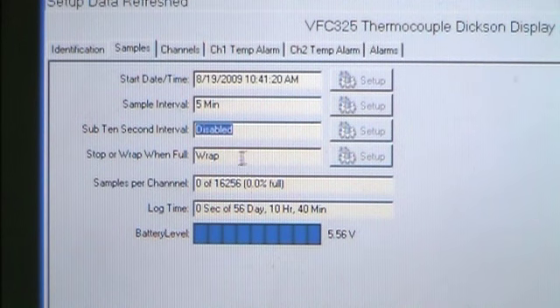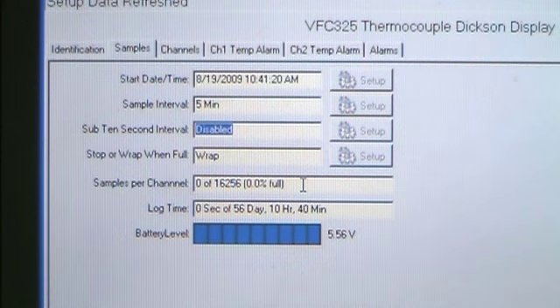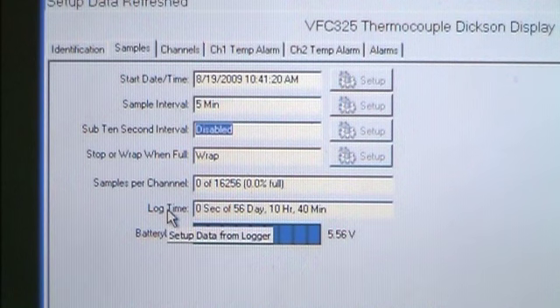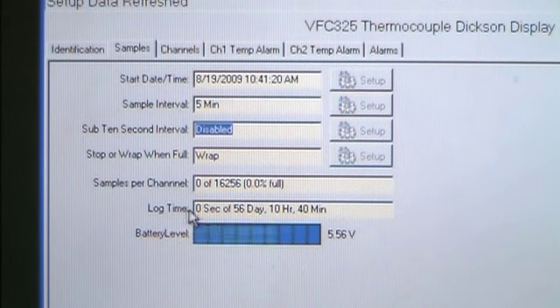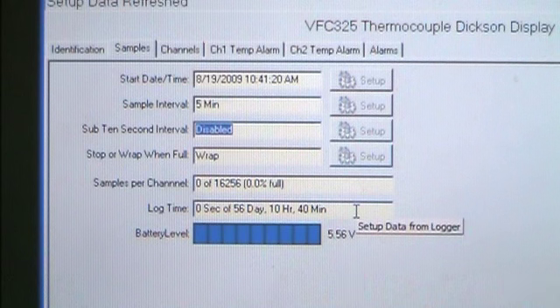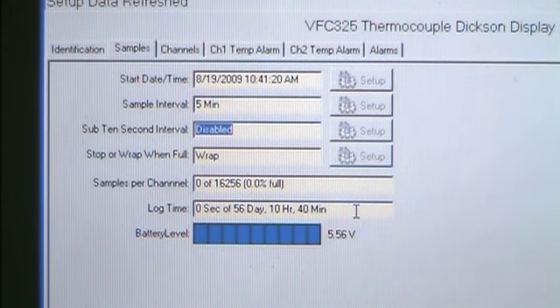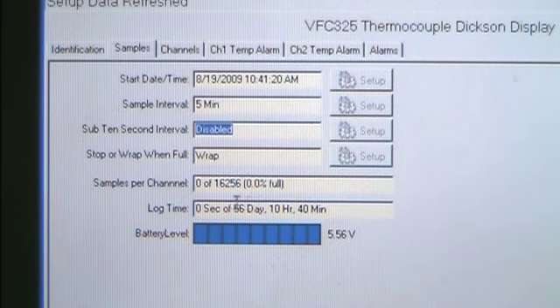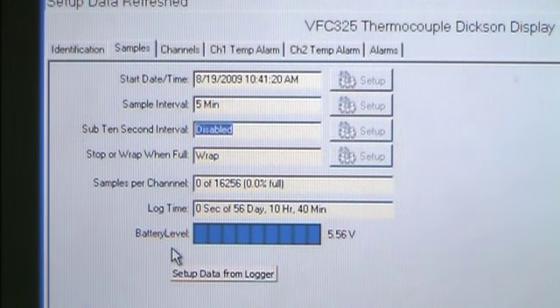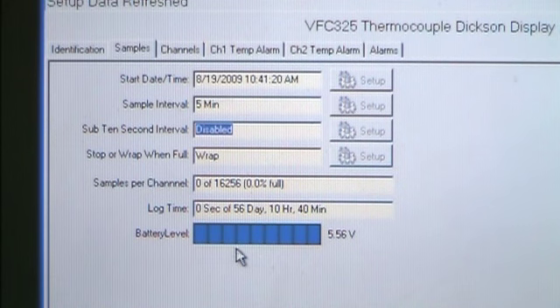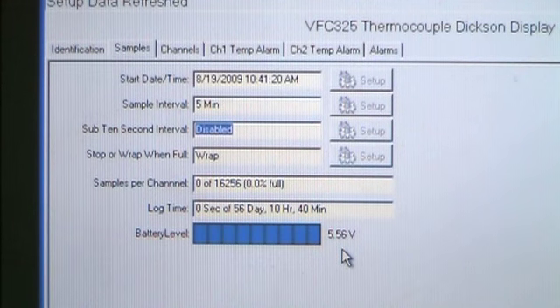The next section is the Samples per Channel. This logger currently has zero recorded points. The next section is the Amount of Logged Time. This current unit has zero recorded periods of time. Finally, the Battery Level shows the amount of battery life currently available. Blue bars indicate the strength of the battery life. The Troubleshooting section explains some ways to achieve longer battery life.